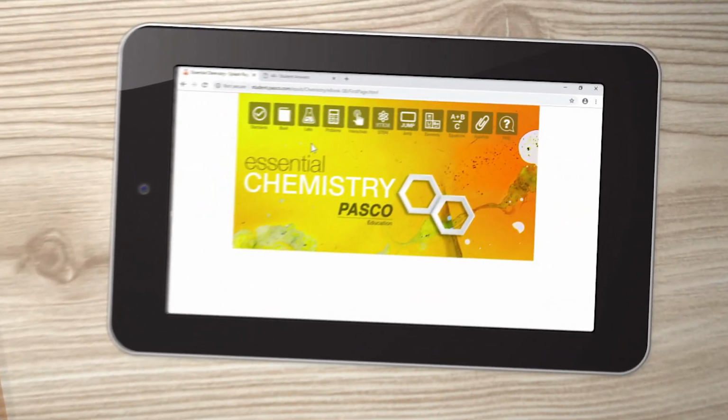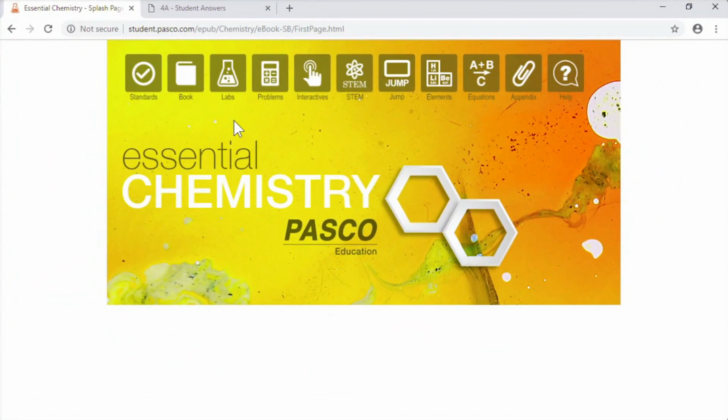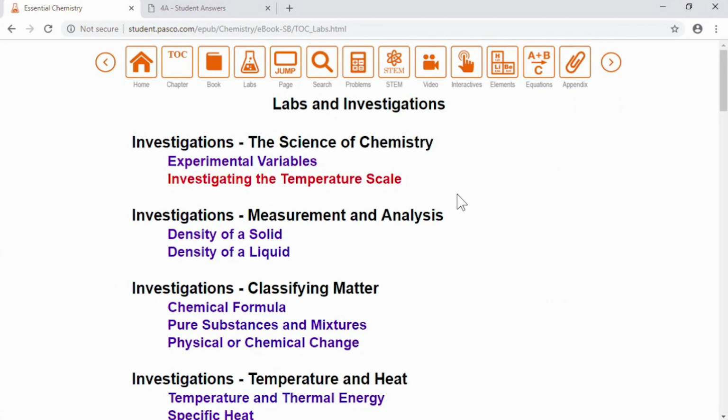Hi, and welcome to the video guide to using SPARKvue software with Essential Chemistry. There are over 70 laboratory investigations, including engineering design challenges, over half of which use live data collection with Pasco sensors and SPARKvue software.